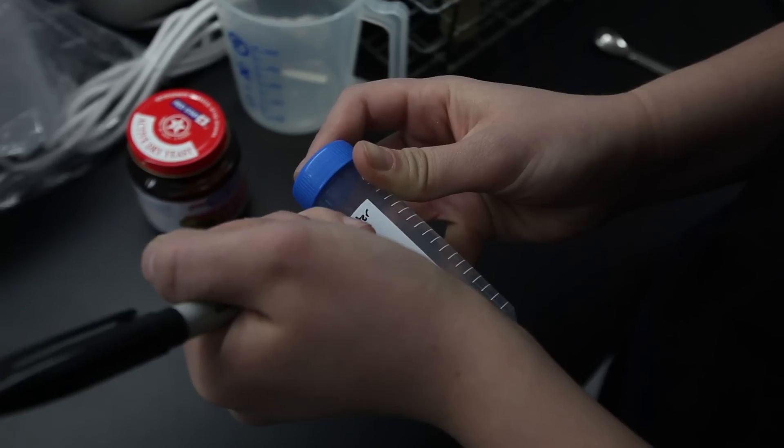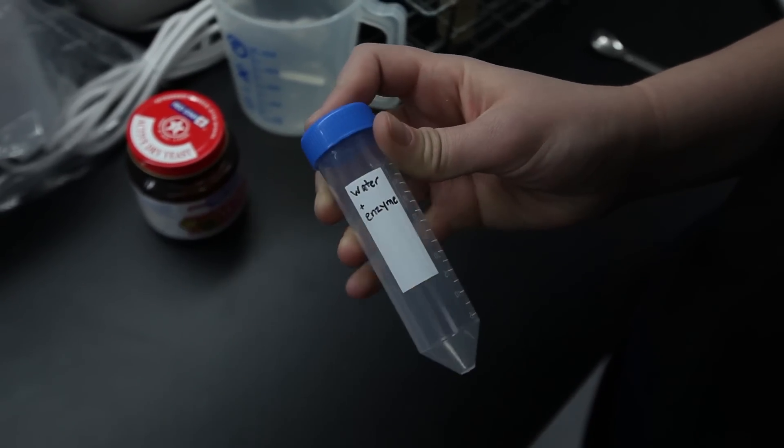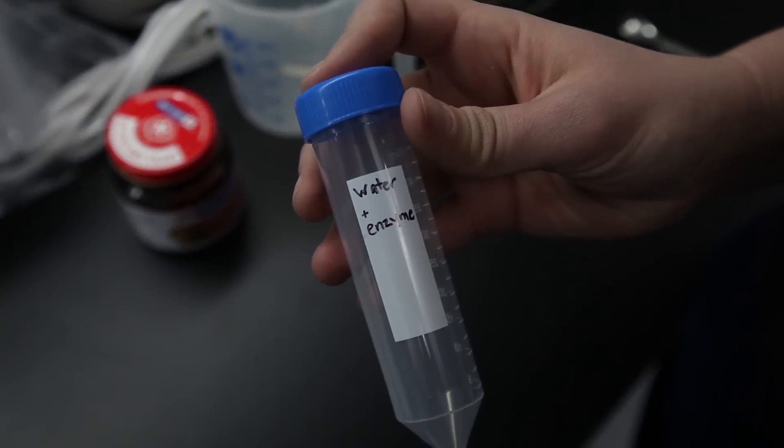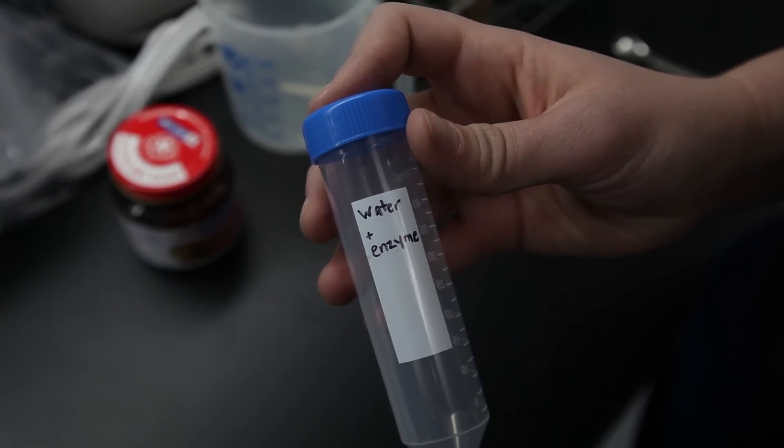It is good scientific practice to create a control to isolate background glucose and ethanol levels. Controls can include biomass samples without enzyme, water with enzyme, or just water.